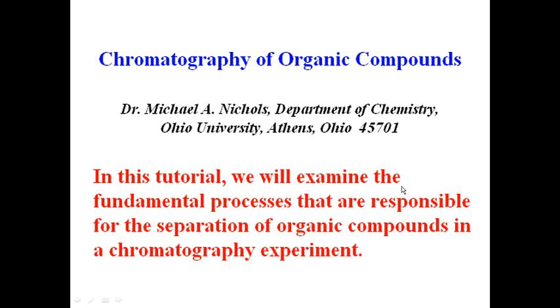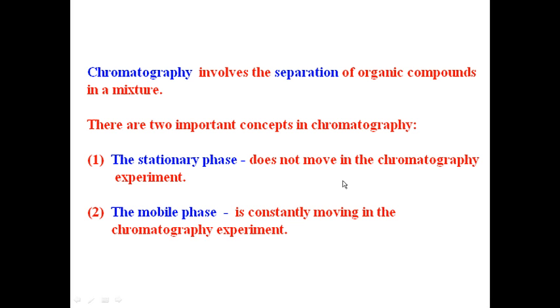Okay, this is a tutorial on thin layer and column chromatography of organic compounds. And so first we should define what chromatography is. Any type of chromatography, and there are many that you'll learn about in organic chemistry, involves separation of organic compounds in a mixture.